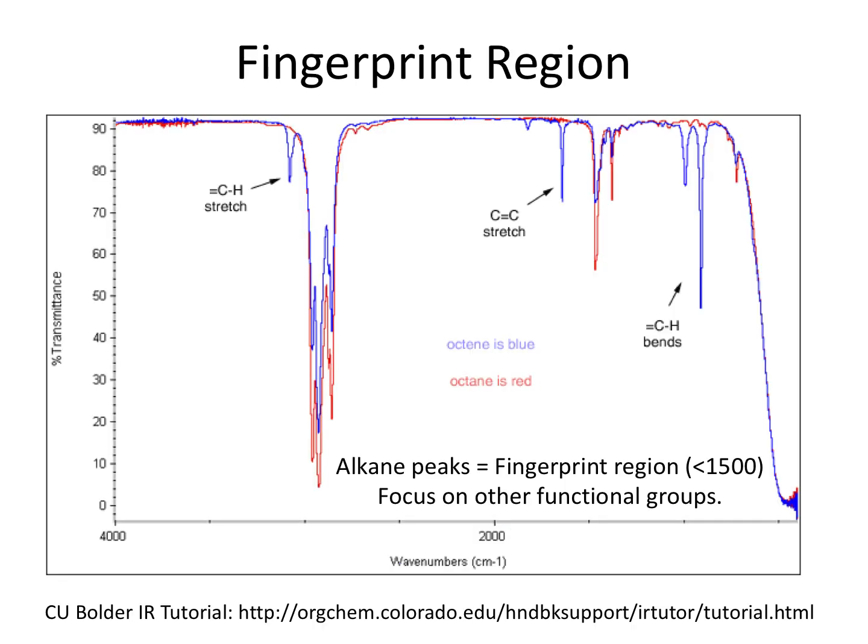Here we have a picture with the two previous spectra that we saw overlaid on top of each other. As you can see, the blue one is the second one we saw, and the red one is the first one we saw. Most of the things are pretty similar, right? If you look, there's that big peak that we're ignoring on the left, and then on the right side, there's some things that overlap, and then there's some key peaks on the right, but not as many. The one on the left is the key thing. The stuff on the right is called the fingerprint region. The fingerprint region is anything that's below 1,500.